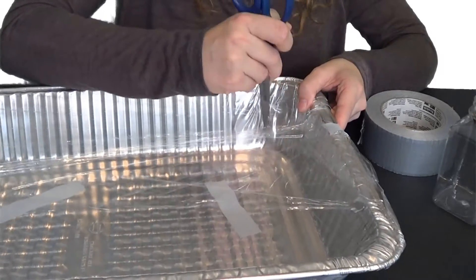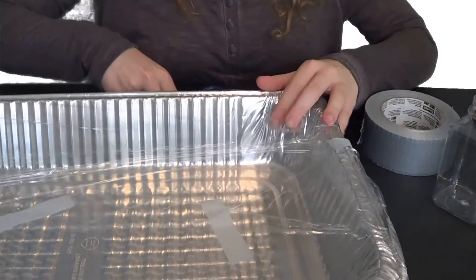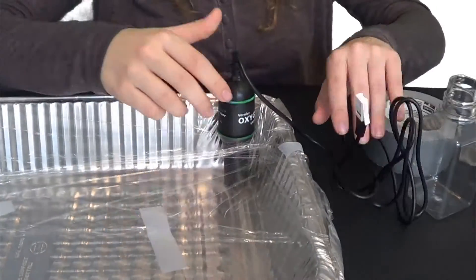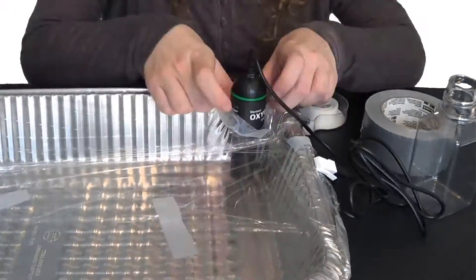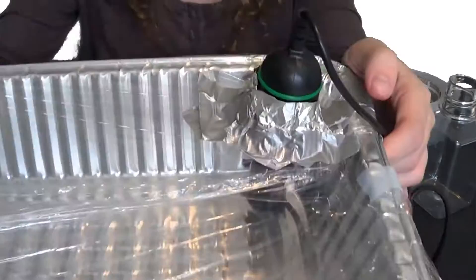Now cut out another piece of the plastic wrap for the sensor opening. This hole can go anywhere, but placing it in the corner opposite to where your candle will go is recommended. Because of the shape and design of this particular oxygen sensor, putting it in the corner straight up allows it to lean against the side without falling over. Once you get it in a good place, tape it down around the plastic wrap, making sure to seal it well.